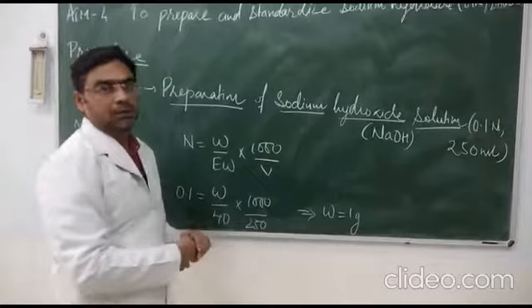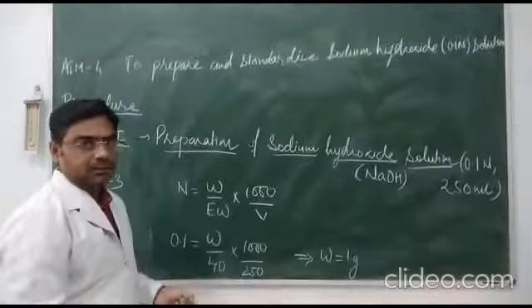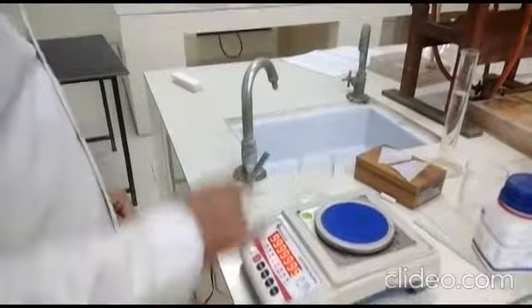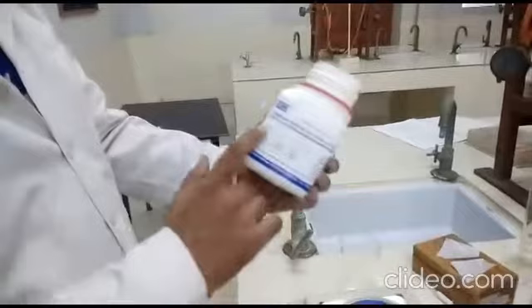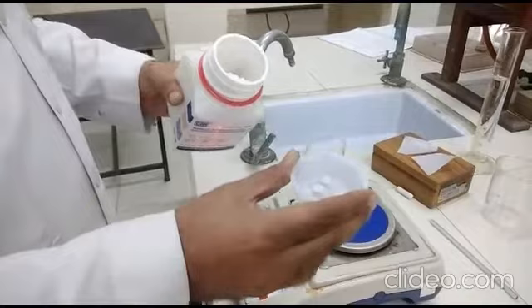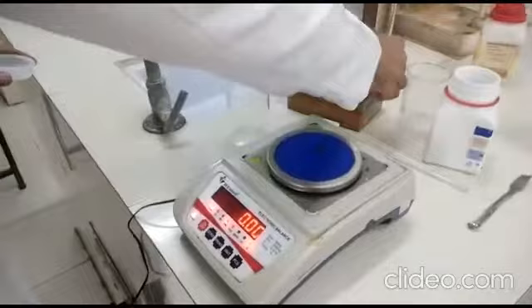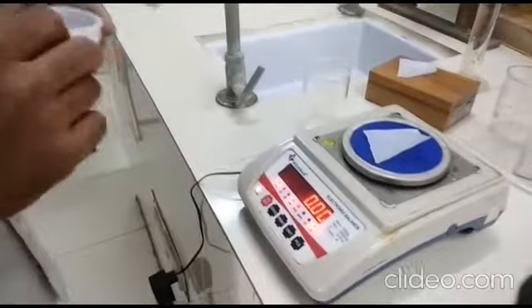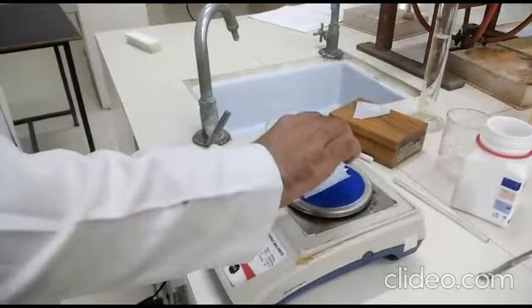Let us do this step by performing the experiment. Now we will start the digital balance. We have to weigh sodium hydroxide — you can see these are the sodium hydroxide pellets. We take the butter paper, place it on the balance, and tare it to zero. Now we have to weigh 1 gram as per our calculation. It is showing 1.58, so we will take some back.